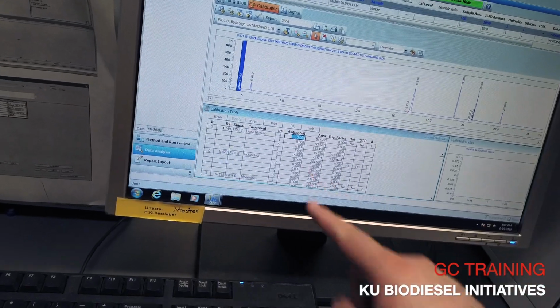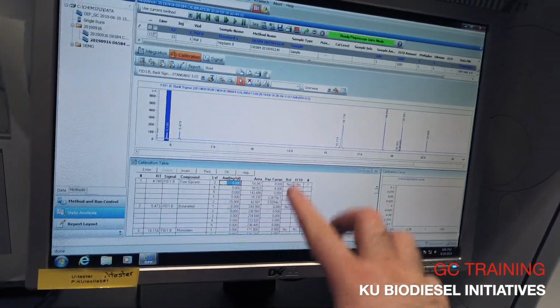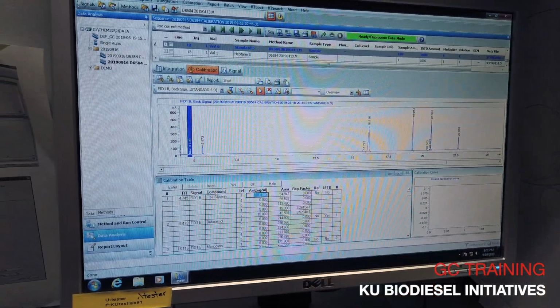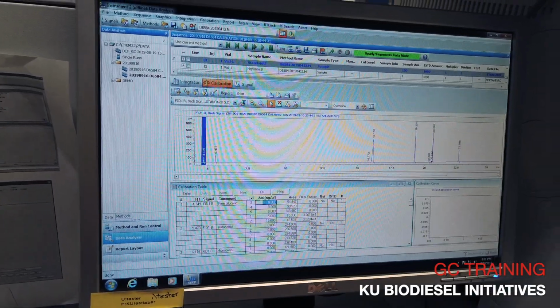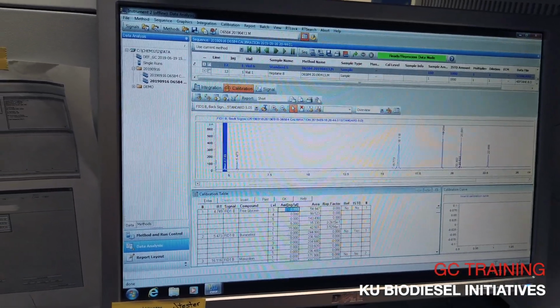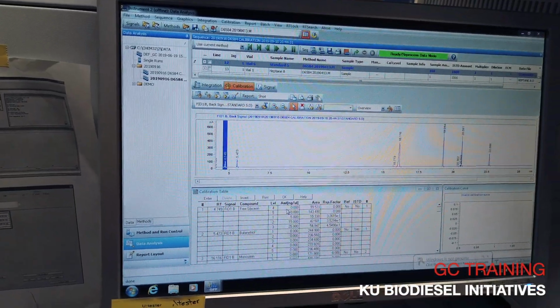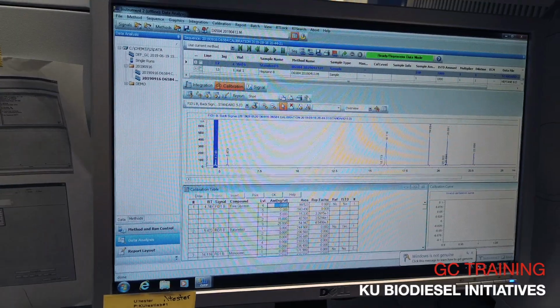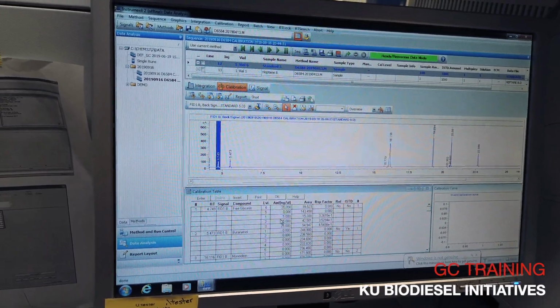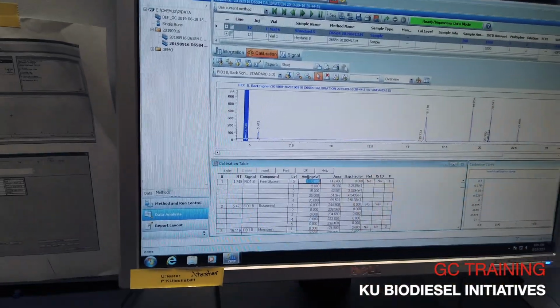You have to be careful, because once you put a number in, it will drop if it had a 0 in it. So after we populate all of this, then it won't move. Okay, 25, 35, 35, and then 50.